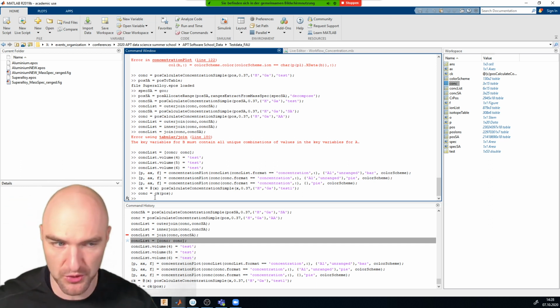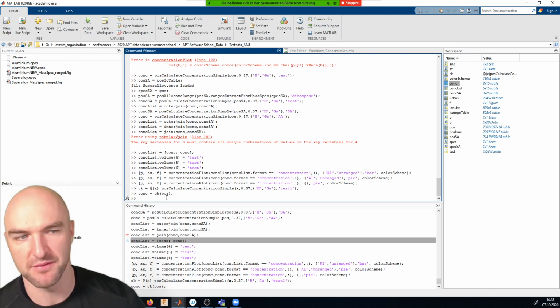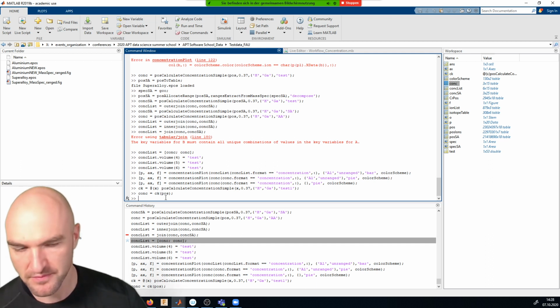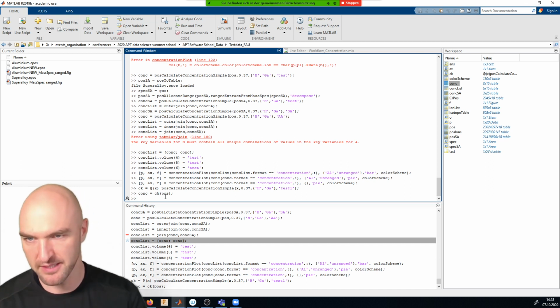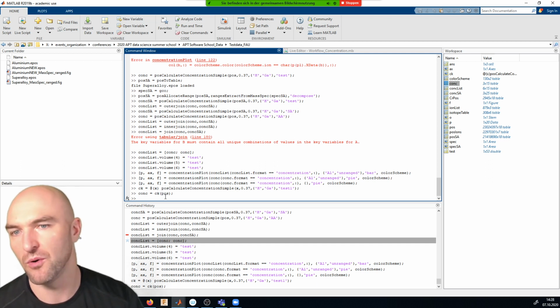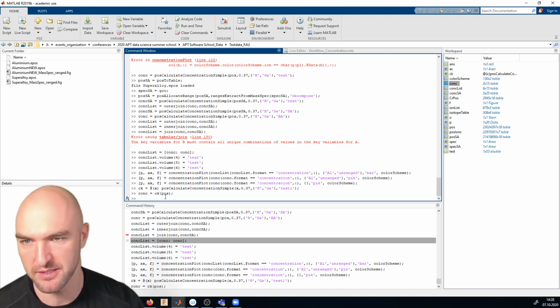And the reason we do that is actually that now our function here is a variable. So I can go and pass this function into some other programs, and these other programs then can use that function to perform some sort of task. And for us, this task is usually creating a proxygram, or creating a 1D concentration profile, or creating a voxelization.